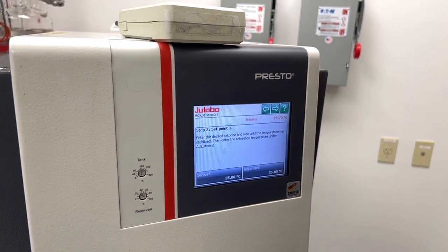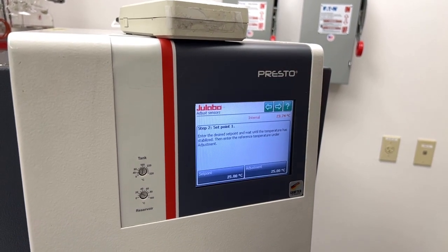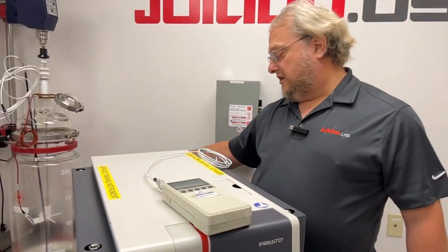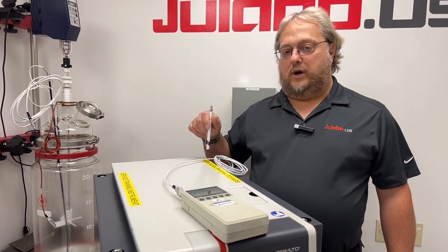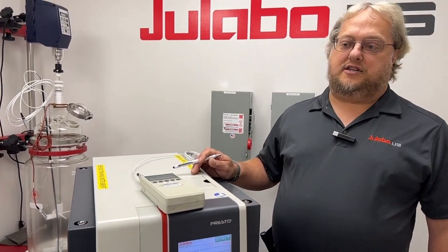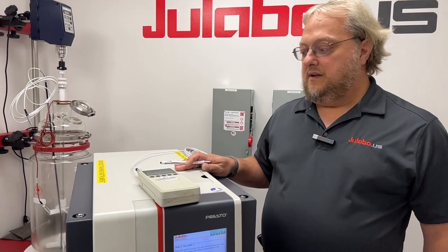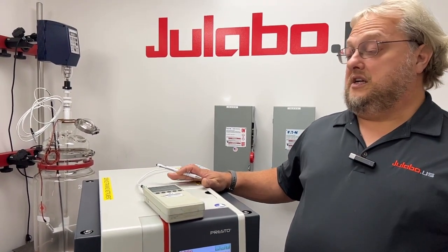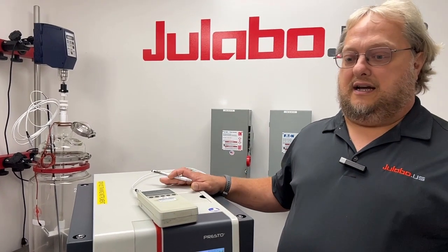When doing an internal calibration we must use an inline sensor coming off of the pump output, because there's no way to put a temperature sensor in the heat exchanger on a Presto. So whenever you want to calibrate the internal sensor it has to be done using an inline sensor.